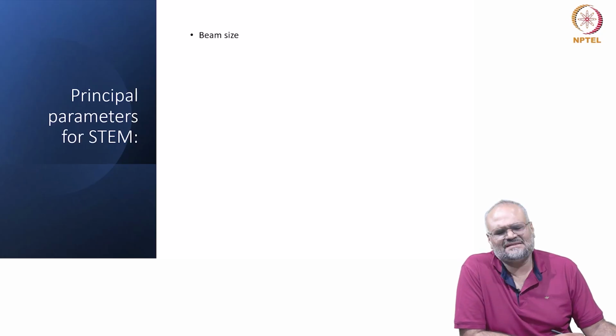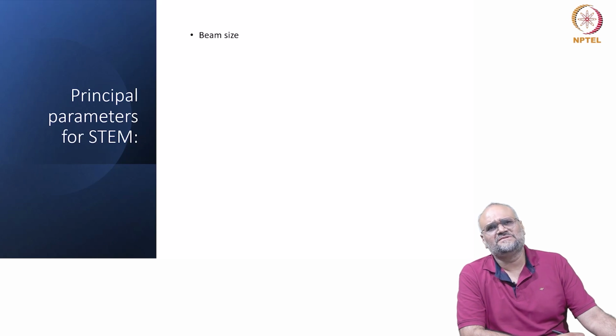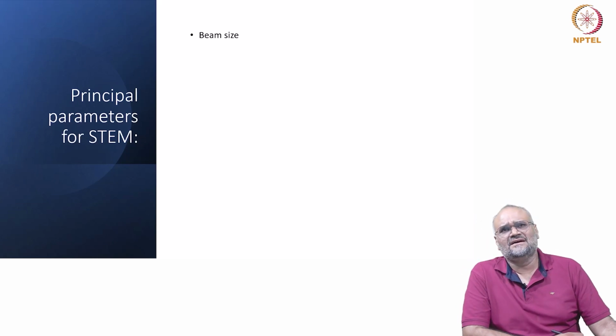The beam size is extremely important, because the beam size or the probe size is what ultimately determines the resolution.